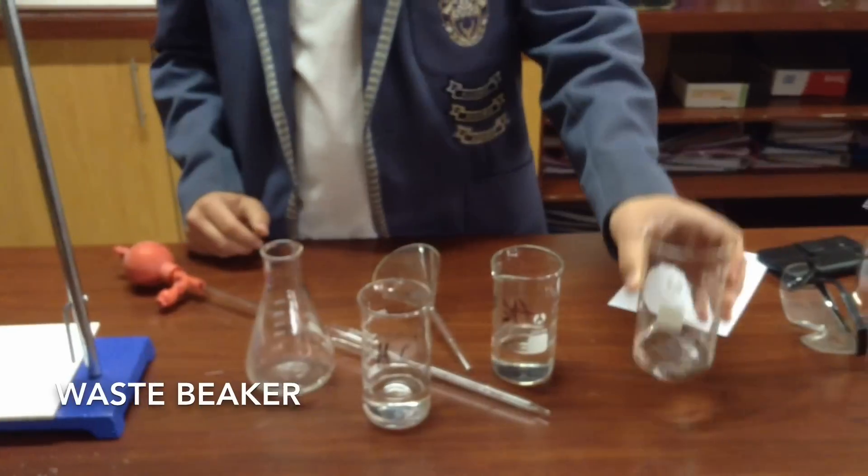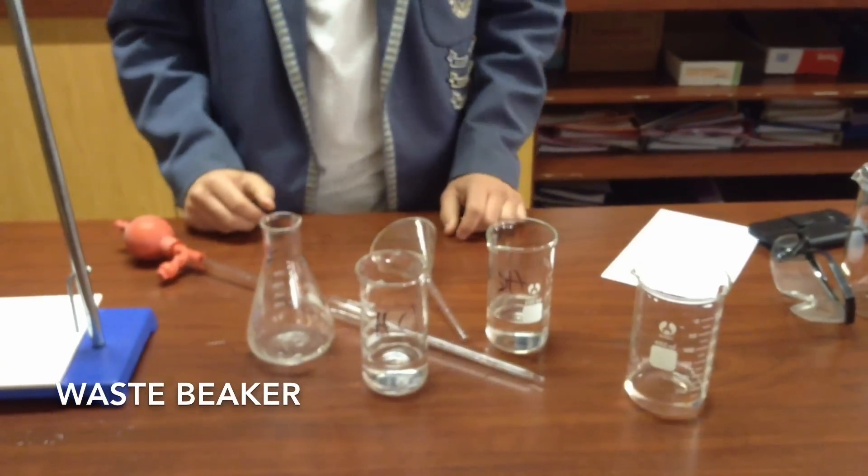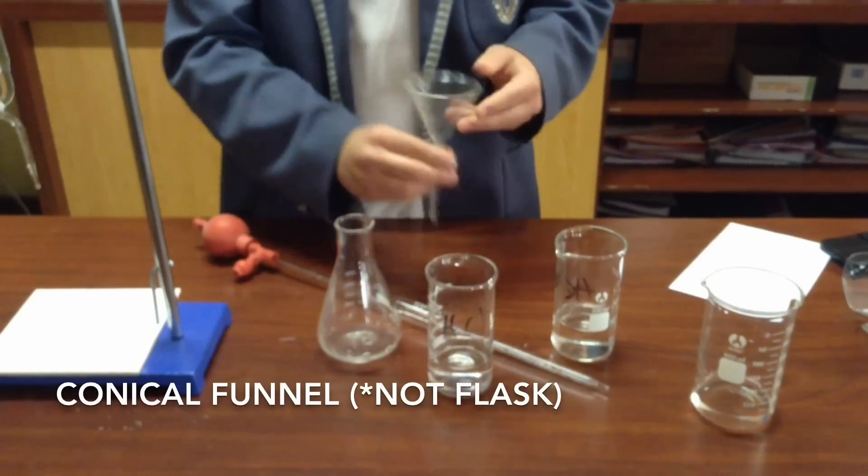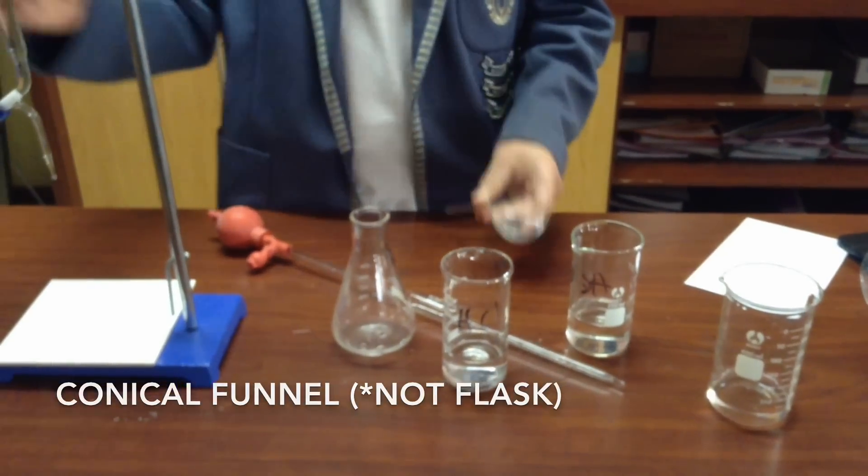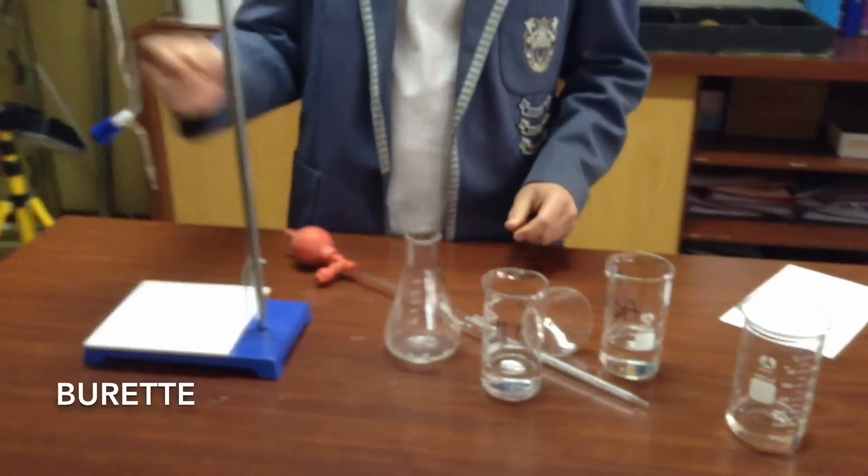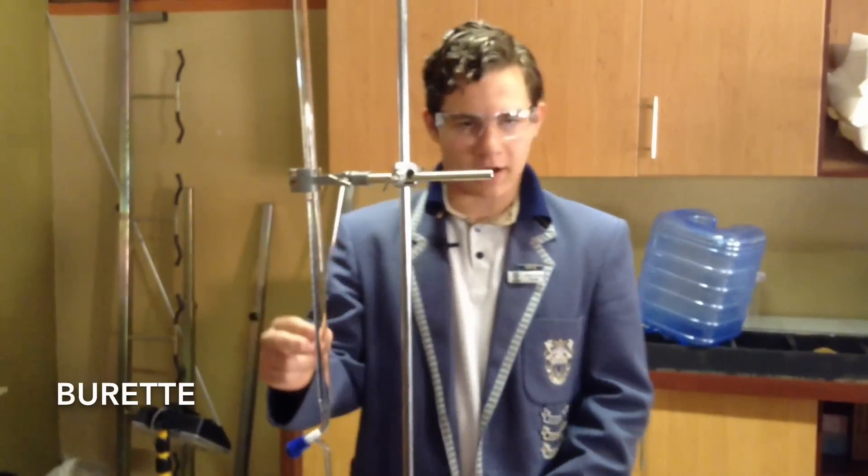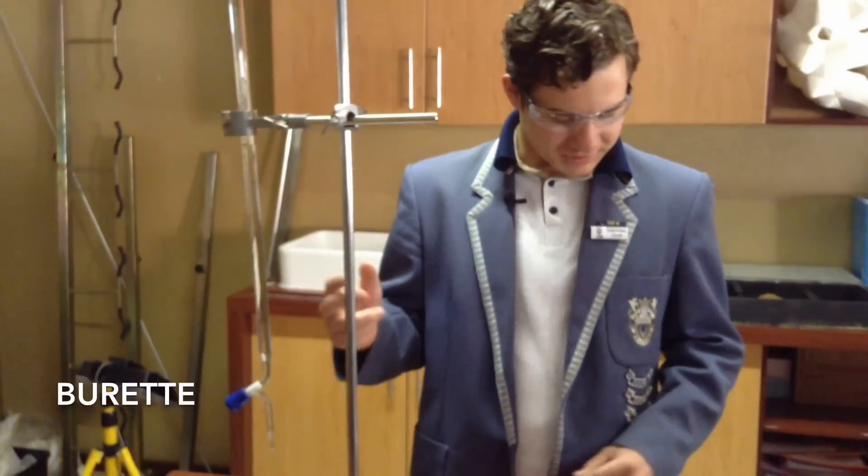You're also going to need a beaker for your waste for when you finish your titration. You're also going to need a conical flask which we're going to use with the burette. Then you'll need a burette, and the burette we're going to fill with our titrant.